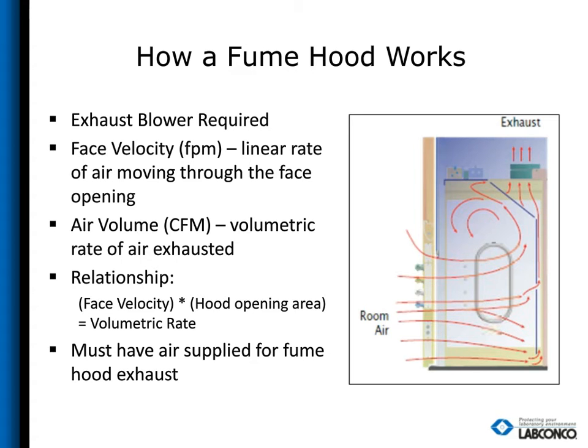I like to compare this to water because it's a simple example that everyone can relate to. When you're watering some flowers, but the water from your garden hose isn't reaching the ones in the back of the yard, you put your thumb over the end of the hose and the water sprays farther. And it does this because the speed of the water increases. It's not more water. The volume of the water does not increase. It's the exact same amount of water through a smaller opening. Also, within that relationship, if you turn the water up within the same opening, the velocity will increase.